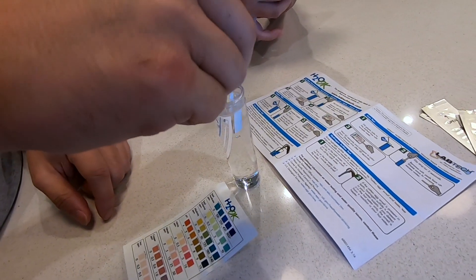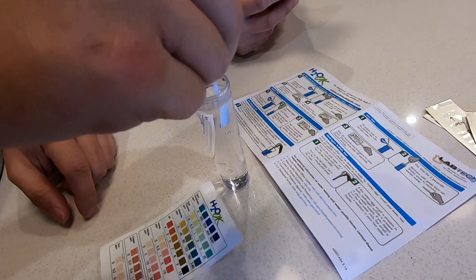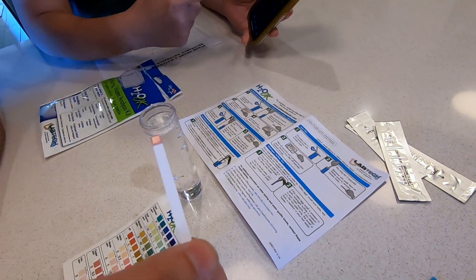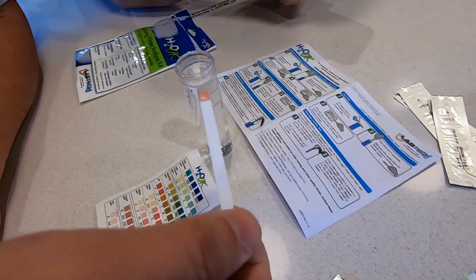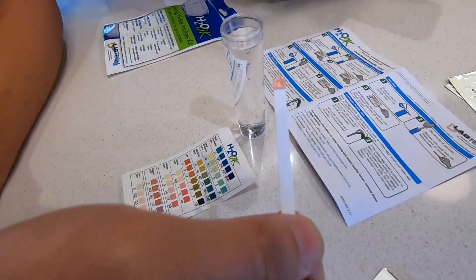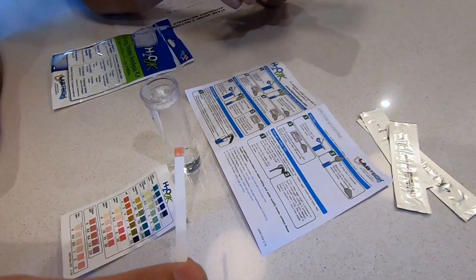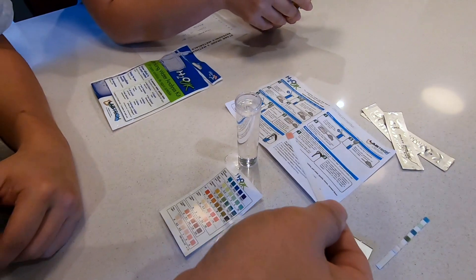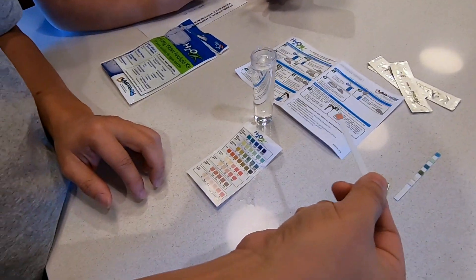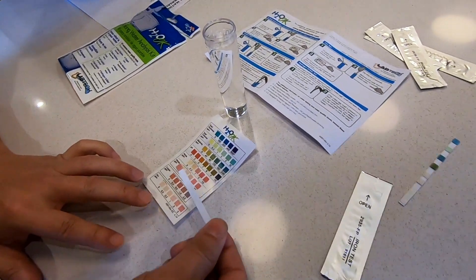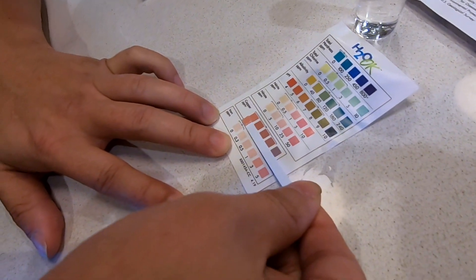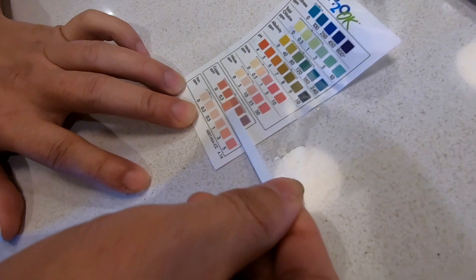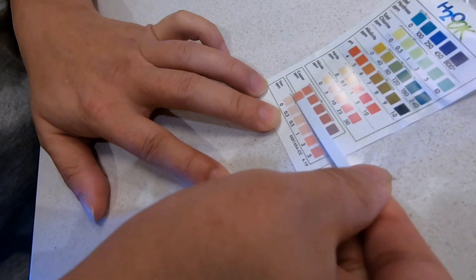So dip it, swirl. One, two, three, four, five, six, seven, eight, nine, ten. Remove it, wait 15 seconds. One, two, three, four, five, six, seven, eight, nine, ten, eleven, twelve, thirteen, fourteen, fifteen. This is no good after 30 seconds so we're gonna have to measure it really quick. I think this is it right here, so it's the first one. It matches more like the first one here which is zero.